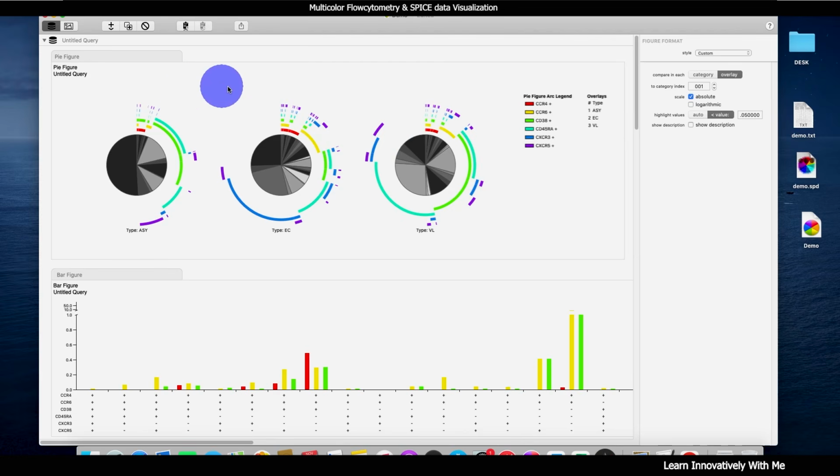I'm not going into greater detail in this, but I just wanted to show you how you can prepare this and present it in your publication. And if you want to know more, you can comment in the comment section. I will try to explain each and every graph in detail so that you can understand easily.